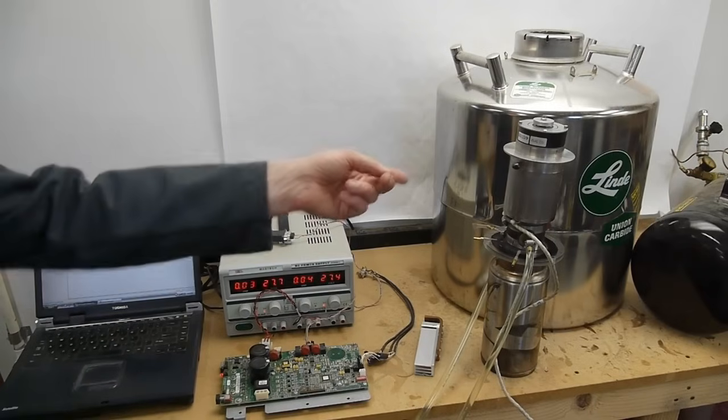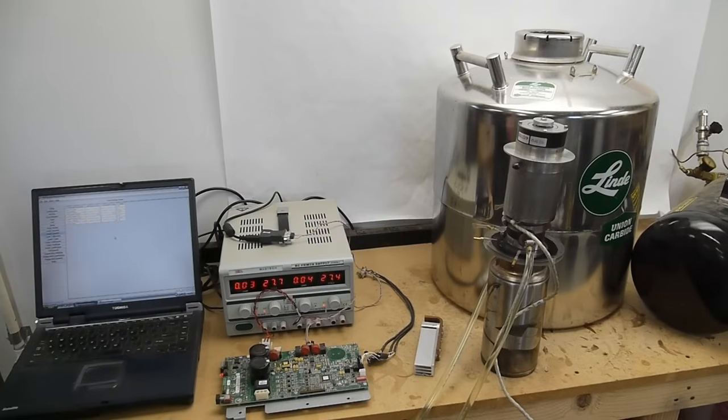This particular cryo cooler is rated at 140 watts continuous input power and I think you get about 7 to 10 watts of pumping power being pumped from 77 Kelvin up to room temperature.